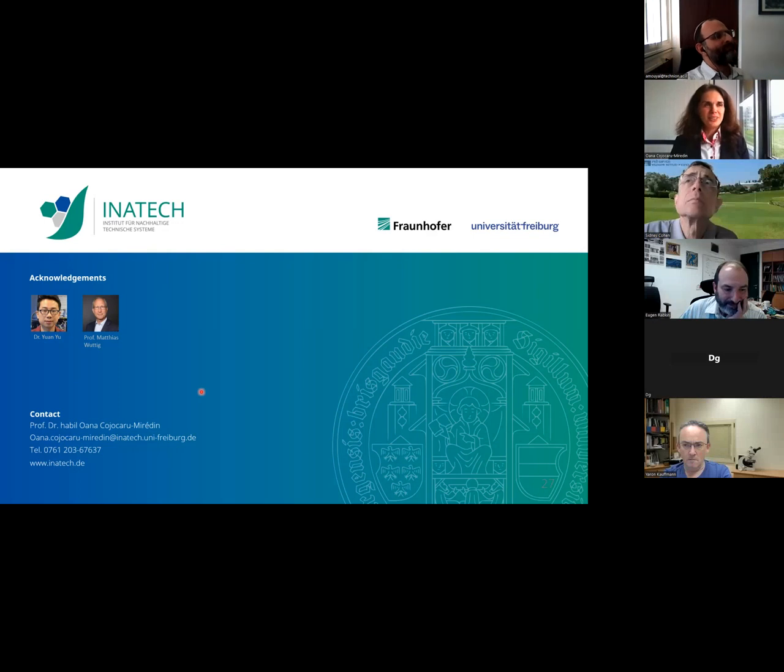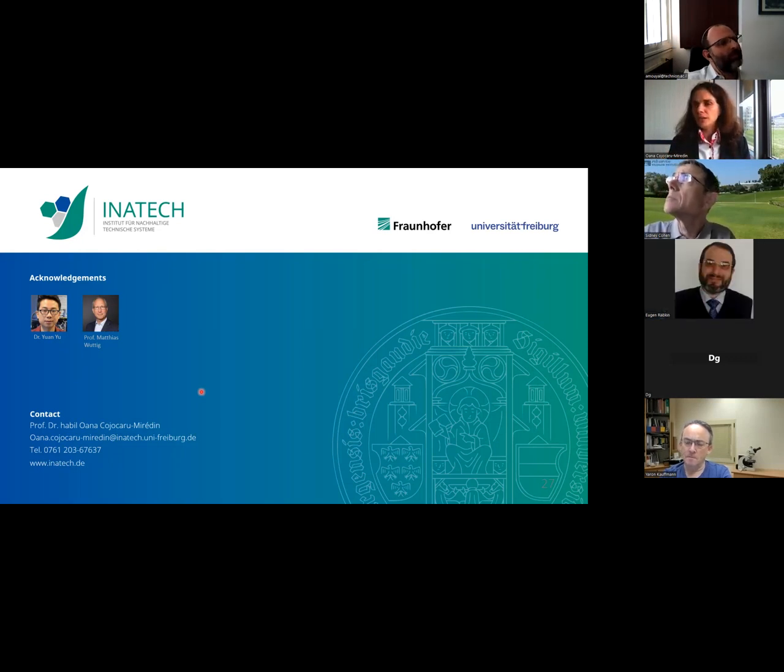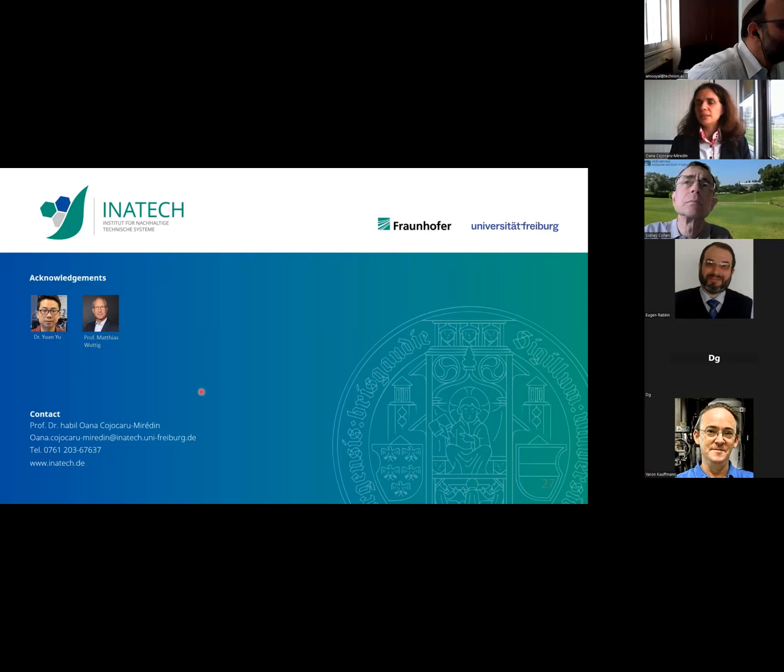Yeah, right. This is a very key question, and the atom probe has been strongly developed to tackle it. If you are interested, the group of Gault in Düsseldorf, at the Max Planck Institute, develops this. The problem with the atom probe is that we have some impurities, very often hydrogen, still in the chamber, and hydrogen or water molecules can easily get inside the tip. Of course not in a very high proportion, but it makes quantitative analysis very difficult.